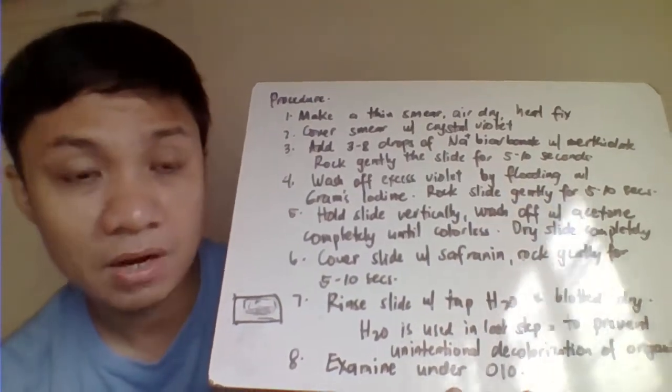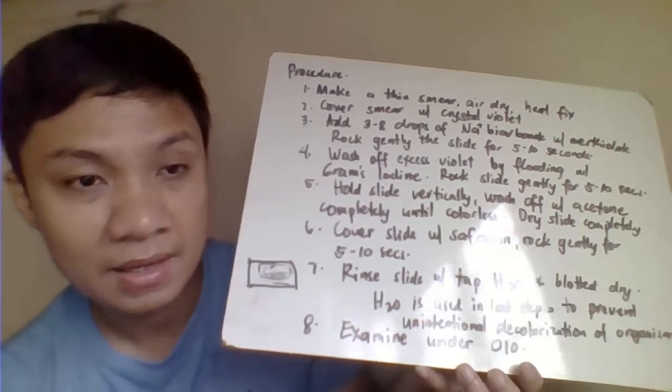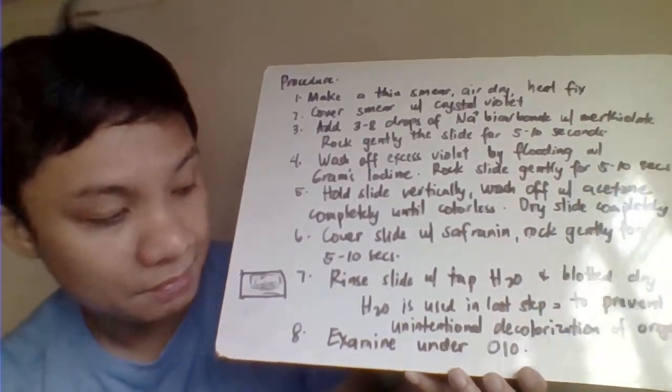So instead of gram positive, it may become gram negative. Therefore, the washing with water is at the last step.